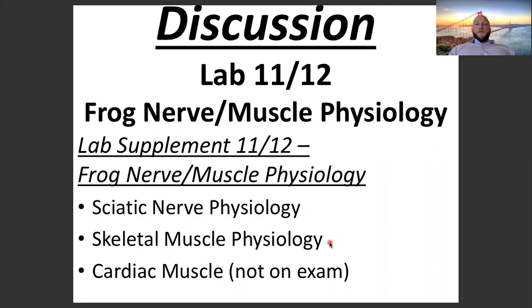With the muscle, we're going to do a similar procedure where we shock the gastrocnemius of a frog with varying levels of intensity of electricity. And we're going to be measuring how much force is generated by the contraction of the muscle. Once we have found what voltage elicits the maximum amount of force generated, we're going to be doing something that we didn't do with the nerve. We're going to see how frequency affects force generated.